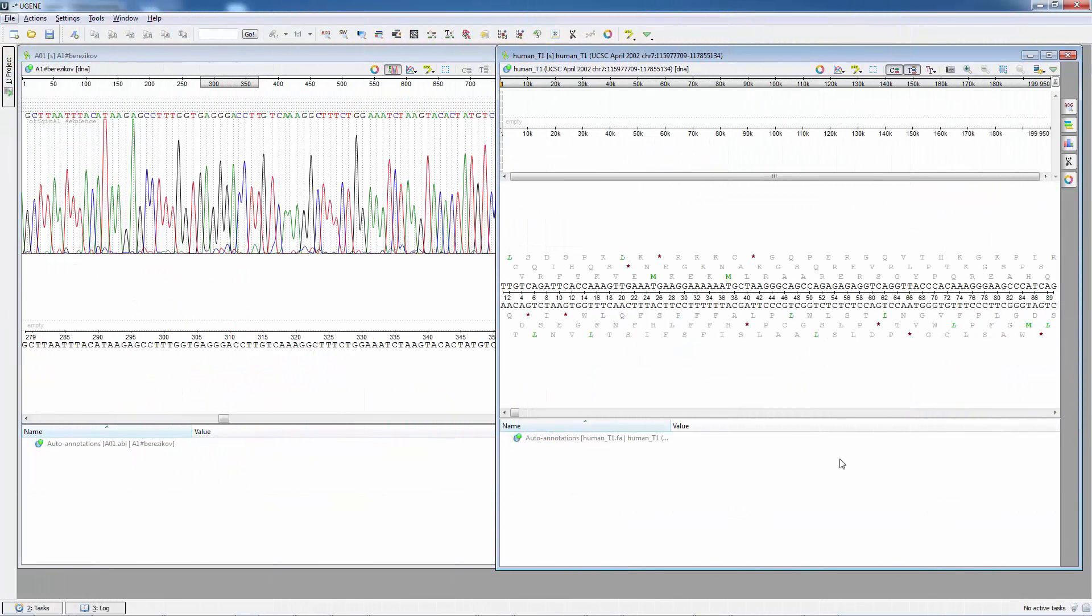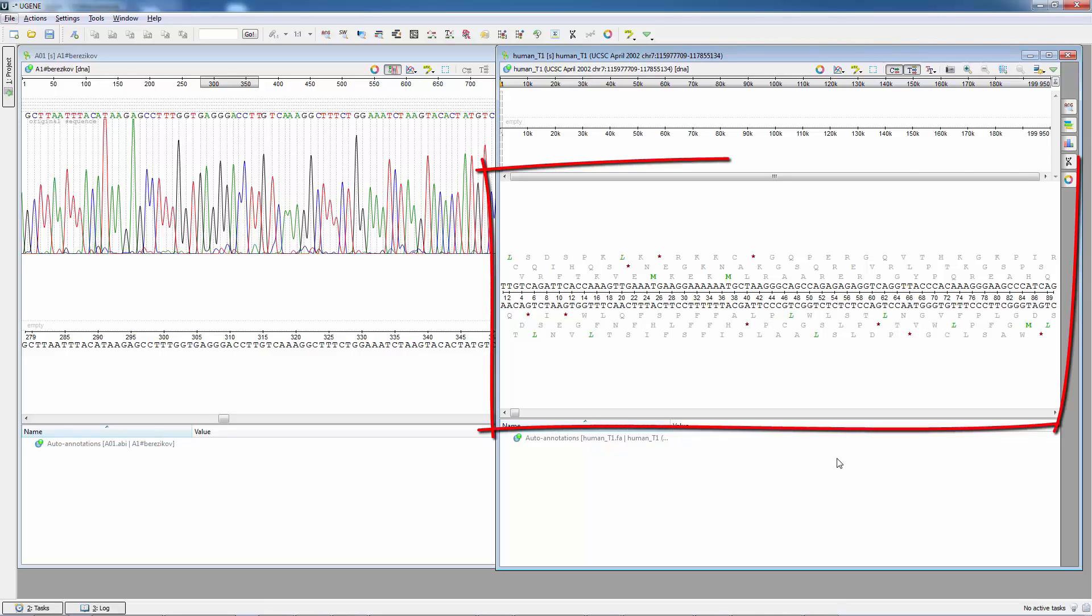Several other usability improvements were added to Eugene. First of all, resizing in the sequence view became more flexible. The sequence details are now shown at the center of the window by default.